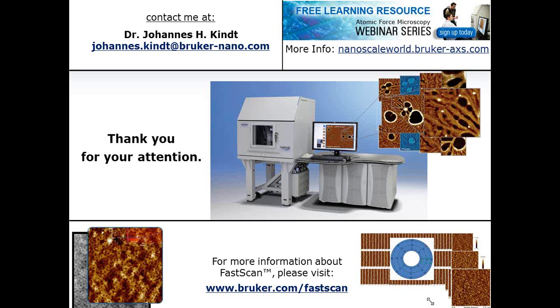Speaking of the topography and the different samples, I think I answered a piece of that. Basically, the sample differences that matter to the AFM on the one hand are the mechanical properties, and if they become extreme, for example, a thick water layer, that can be much more robustly handled in a force curve than in a dynamic imaging mode with a free cantilever oscillation and so on.